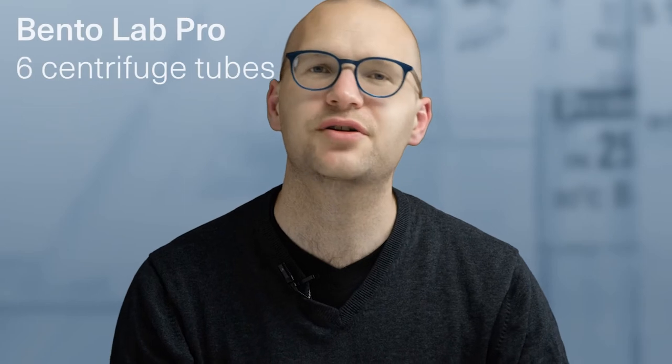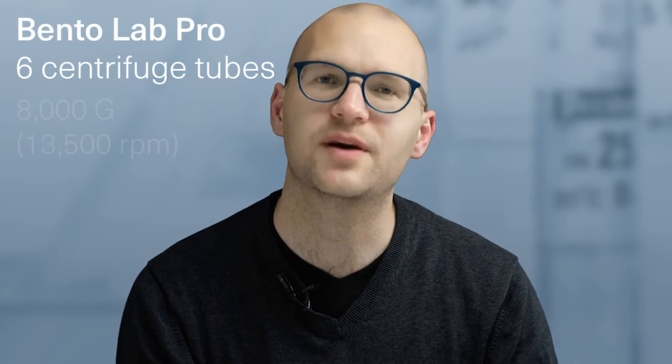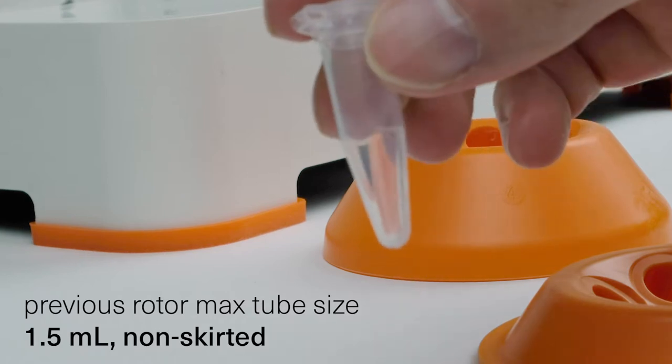The centrifuge module in Bentolab Pro can spin 6 microcentrifuge tubes with a force of up to 8000G. With the previous rotor version, the maximum tube size was limited to 1.5 milliliter volumes in non-skirted tubes.